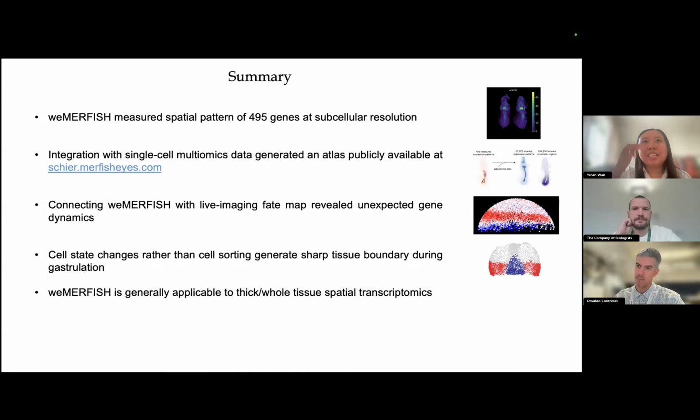But what I want to emphasize is our method is very biologist friendly in the sense that our code book is not hard coded in the library. So you can, for example, design a library of 10,000 genes and selectively image. You can say, I just want to image three or five or dozens of them. You don't have to redesign your library. They don't have to be imaged as a set. So this offers a lot of flexibility. You can just do sequential one gene at a time, or you can do a set of 500 or 1,000. That's your choice. Great, thank you.